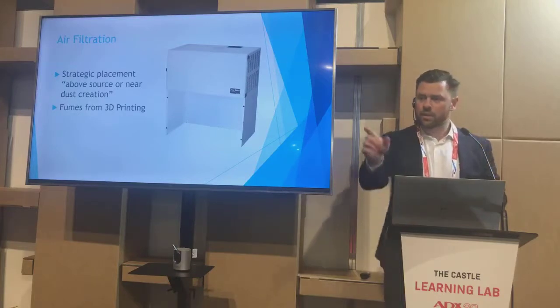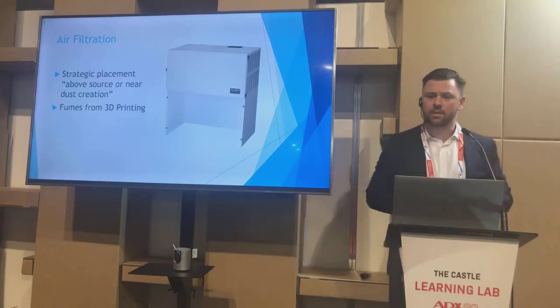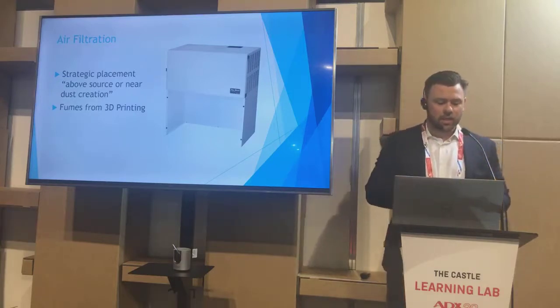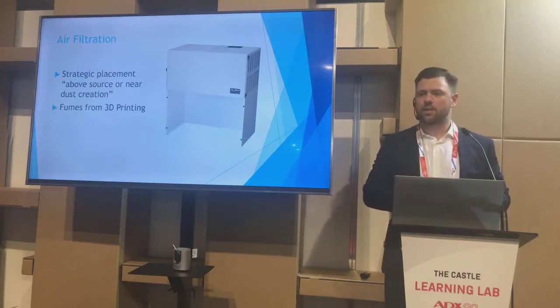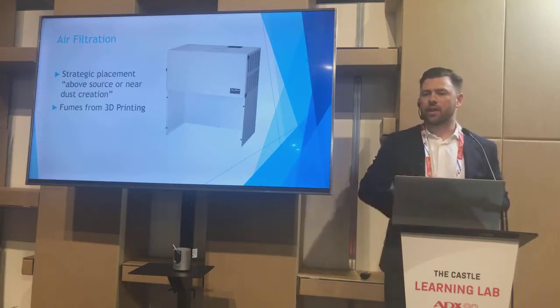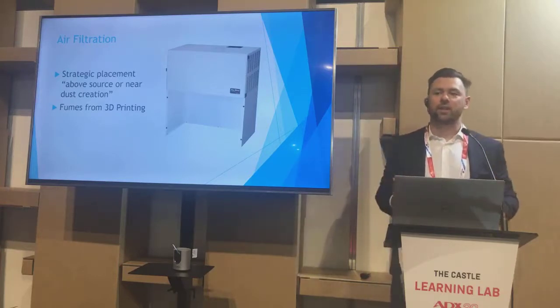Sorry, that's like a cabinet that just recycles the air? That's correct, yes. The question is whether it's just a cabinet that recycles the air, and that's what this does. It's a ductless air purification. The air goes in through the 4 stages of filtration and then exhausts out. So we call it basically a scrub.